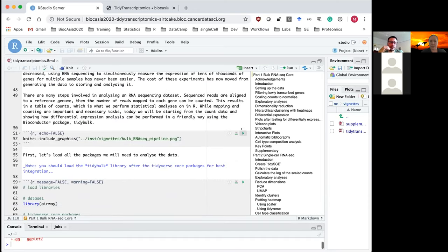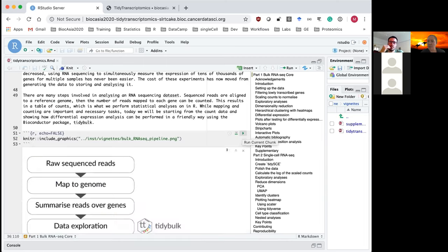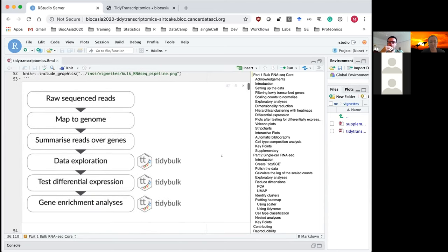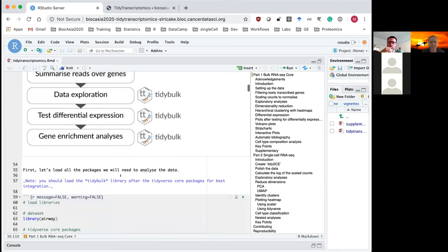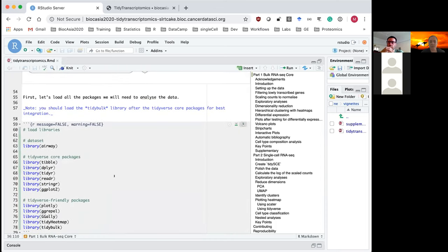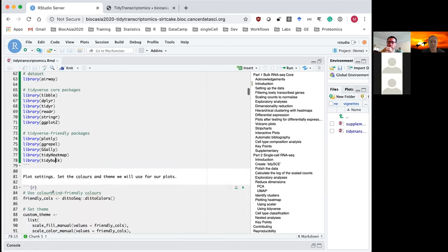I'll be running these code chunks by pressing the play button — you can do the same to see how the code works. This image shows the workflow for RNA sequencing differential expression analysis in a tidy framework. I'm going to load the libraries: tidyverse, tidybulk, and some others.